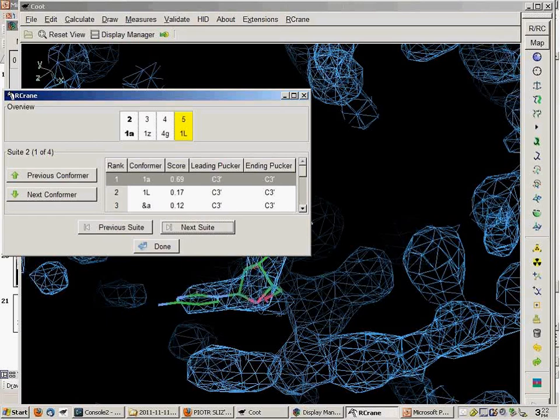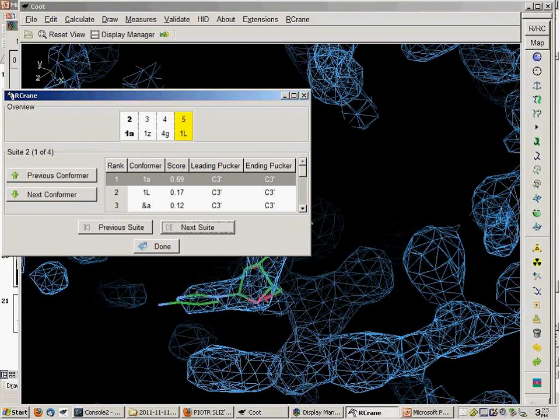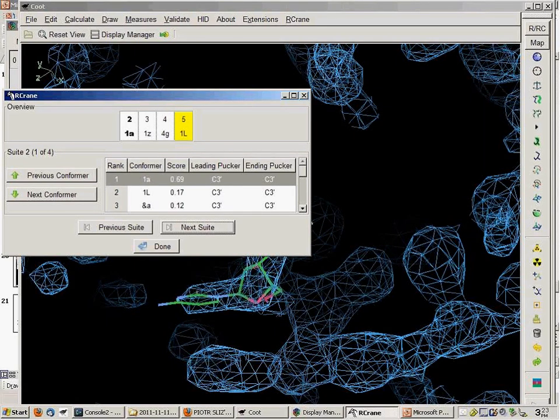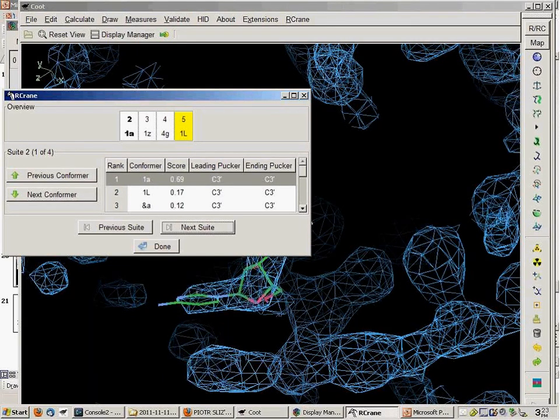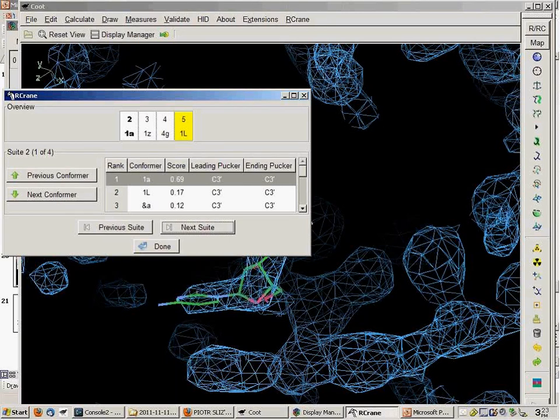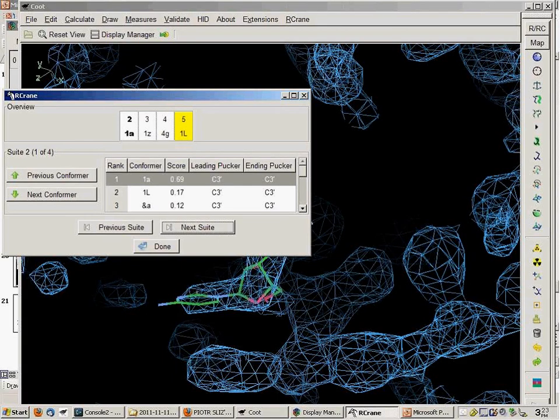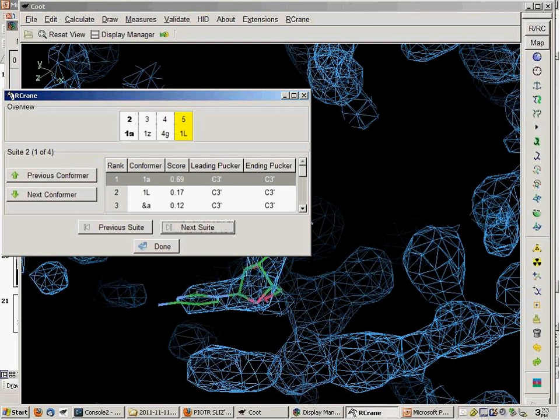And is it possible to change this weight? Is that something that could be tweaked by the user? Not right now. Well, you can change the source code itself, but right now there's no easy way to tweak those things. I've tried to set parameters that are fairly general. The time you can run into problems is if you're trying to build and there's really absolutely no density there.